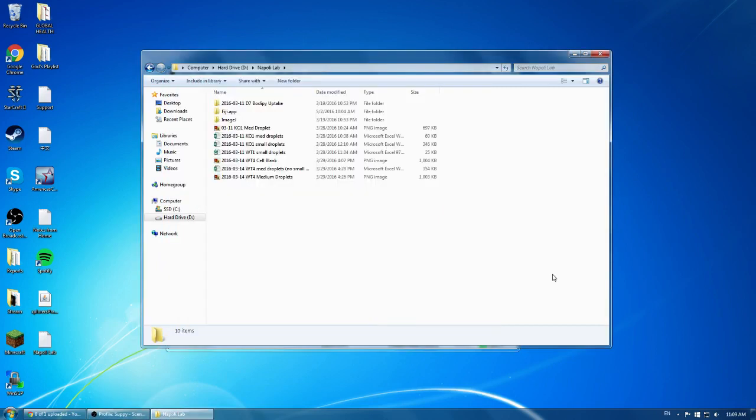Hi, this is a condensed version of how to measure mean fluorescence intensity over an image stack in ImageJ. Specifically, this is going to be on our BODIPY uptake protocol for the Napoli lab, but this could be used more generally for any situation where you want to measure fluorescence over an image stack.